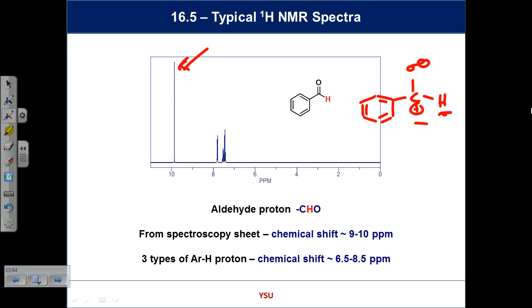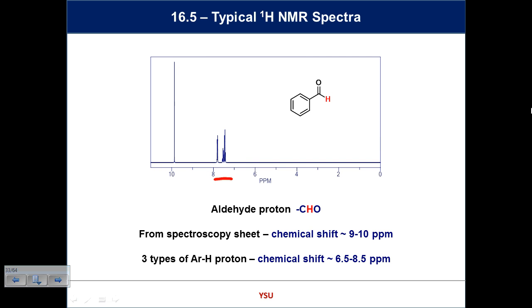And that shows on the graph by being way downfield. And if you see something at 10, and in the infrared spectrum you see a carbonyl at 1700 or something like that, that's an aldehyde. Definitely an aldehyde. So with that in mind, we're seeing here 2 sets of signals. One is the aldehyde. These signals are for the benzene ring. But they seem to be shifted down towards 8. Any ideas why in that molecule those protons should be further away from 7?